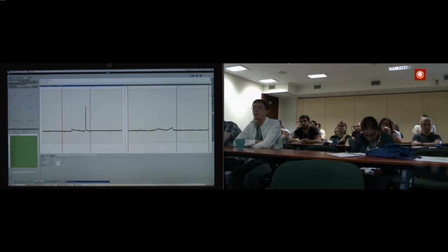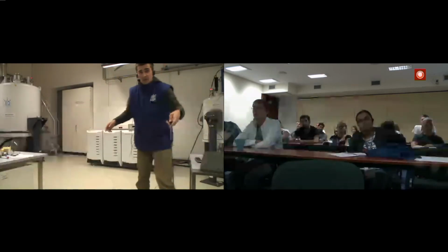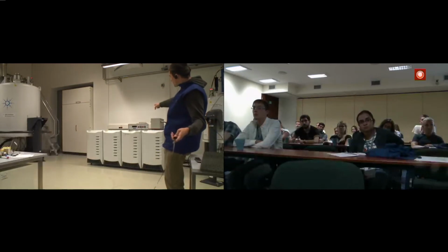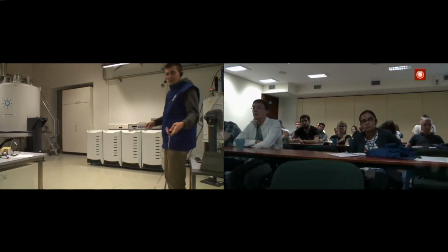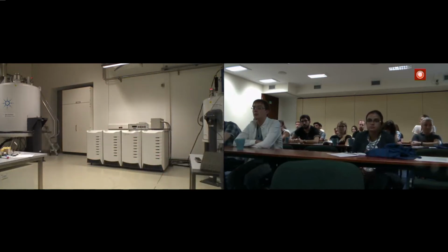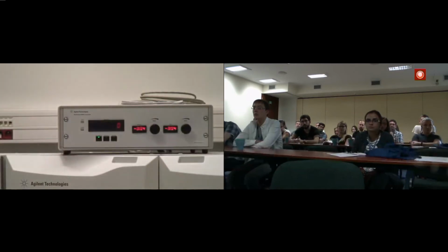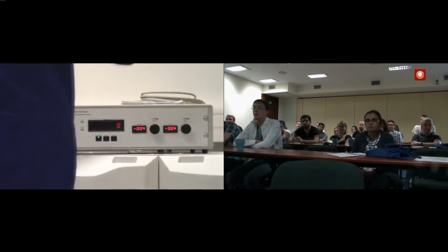So we would like to spin our sample without changing acquisition parameters. In order to do so, I will go over there and show you. Just behind me, there's this magic angle spinning controller. But before I reach the place, I have to take off my headphones. Okay, I hope you still hear me.